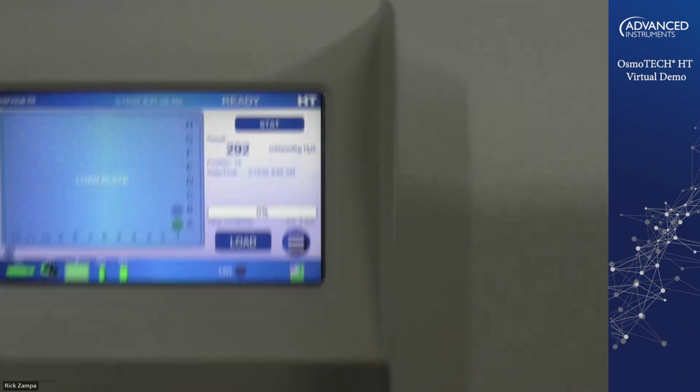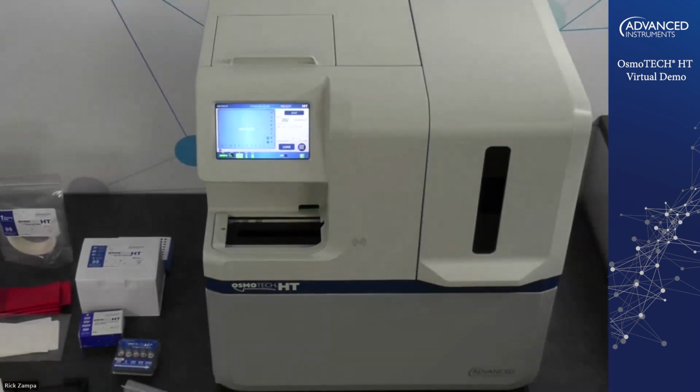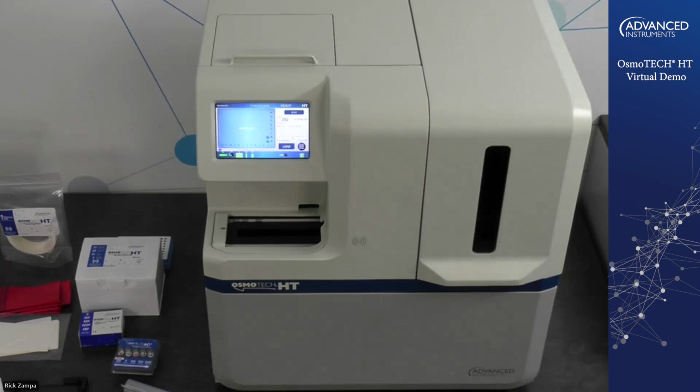Hey, Rick, looks like we only have 1 question so far. Oh, okay. So quick question. In the manual, the limit amount to measure a triplicate states 150 microliters. In the presentation, you stated 180. Which value should be used in their processes?